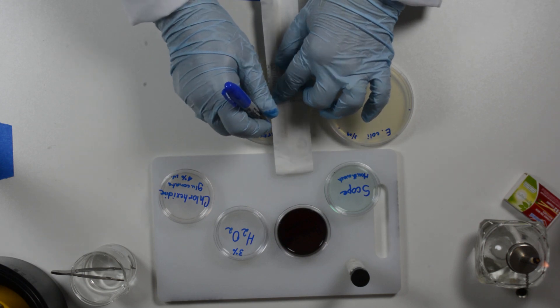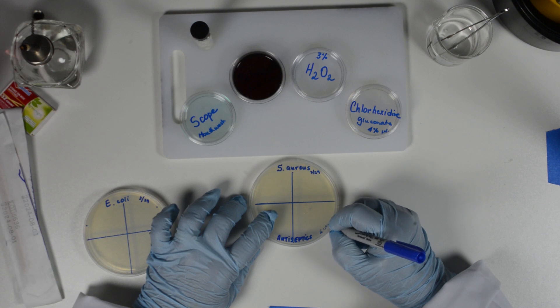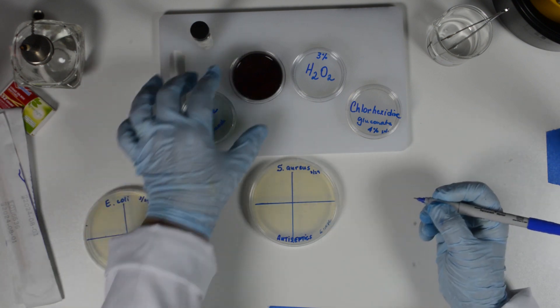We inverted the inoculated plates, traced a quadrant on the bottom, and labeled each quadrant with the chemical we chose to use.